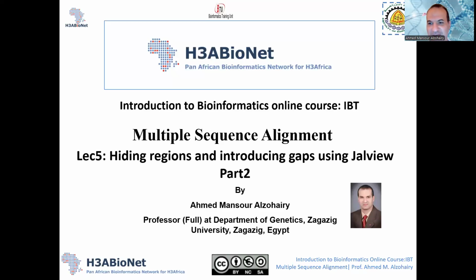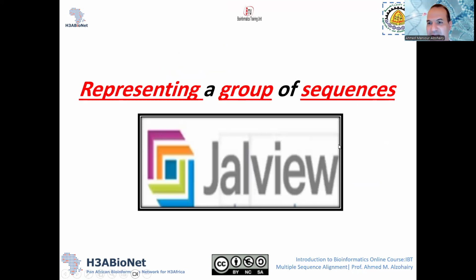Everybody, I hope everything is fine, and welcome back to the second part of Lecture 5, Hiding Regions and Introducing Gaps using Jalview. This is part 2 of that lecture, and in this lecture, we'll just see how to represent a group of sequences.